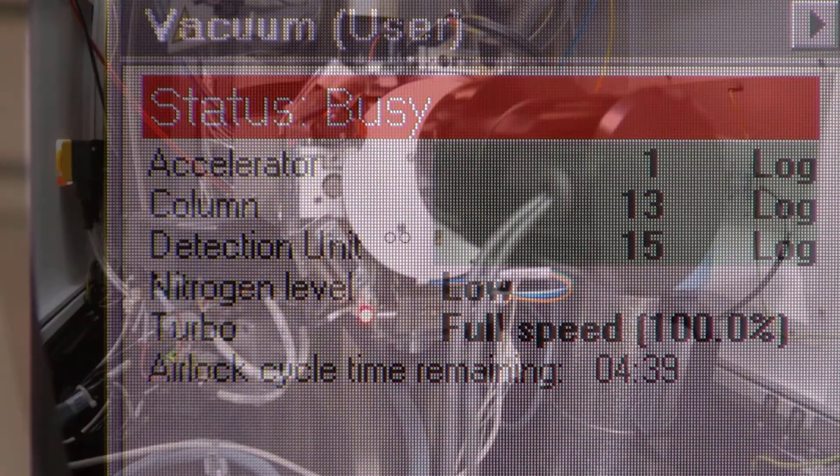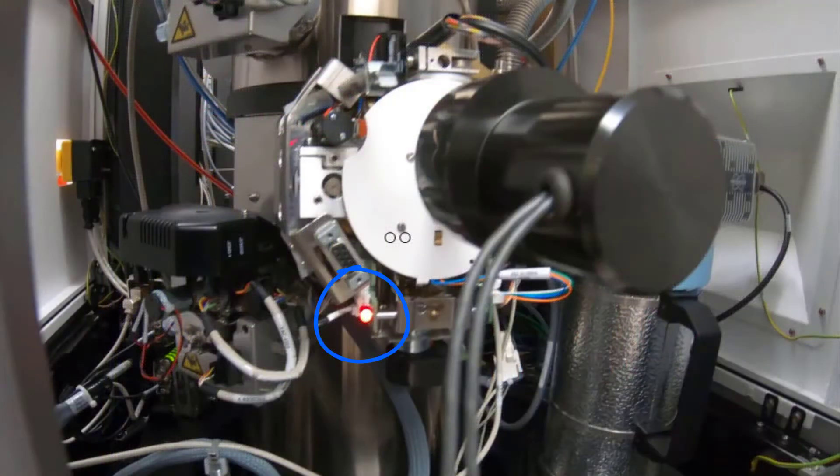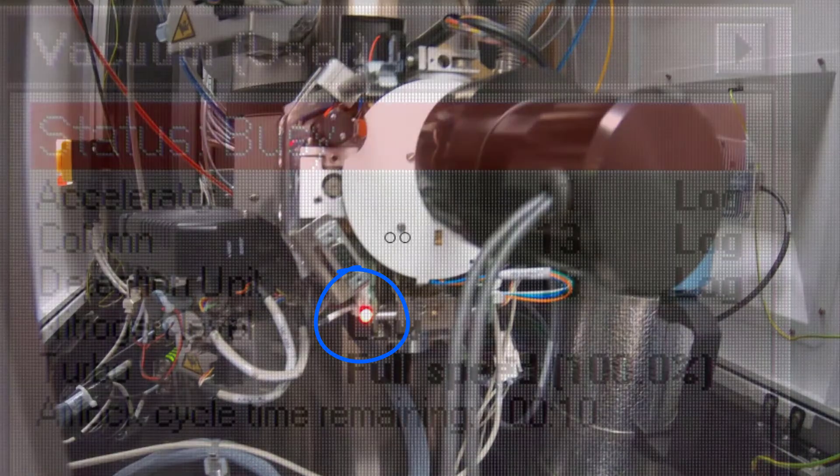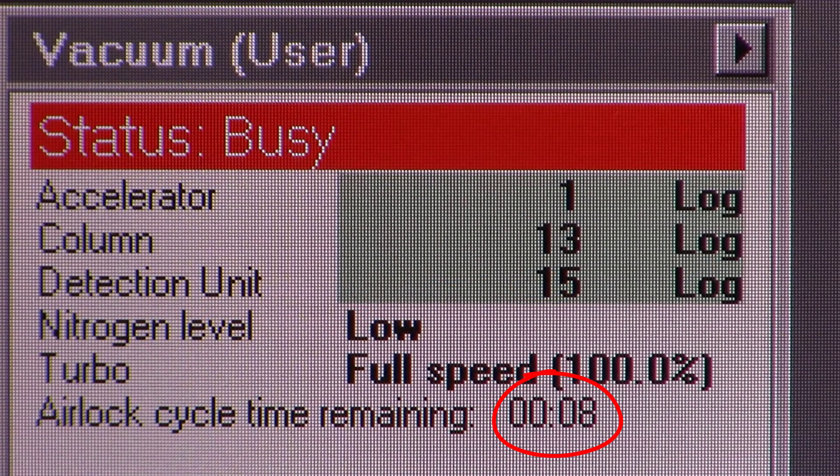The LED light will remain on until the airlock evacuation is complete. Once the red LED light turns off and the countdown has reached zero, you have 2 minutes to finalize the insertion of the holder.